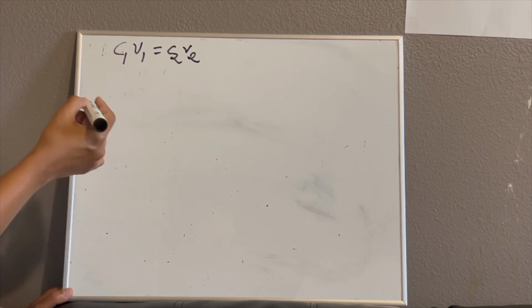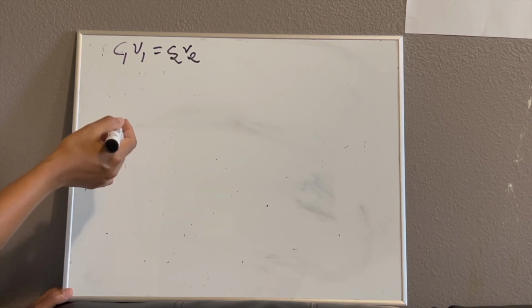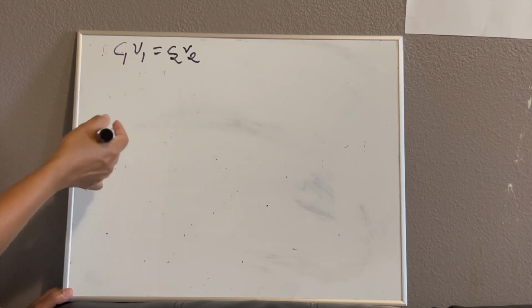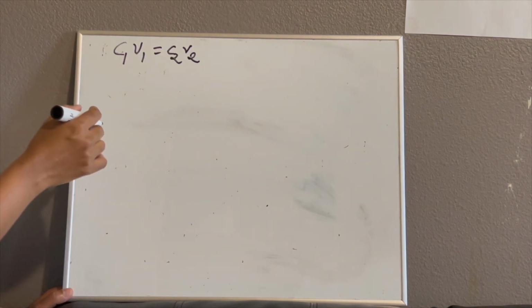So in our lab, wherever I worked, we have schedules where the weighing balance will be calibrated every now and then, almost weekly, or depending upon the usage. If it is used more, it is calibrated more frequently. So it's very important to check your weighing balance when you prepare reagents.